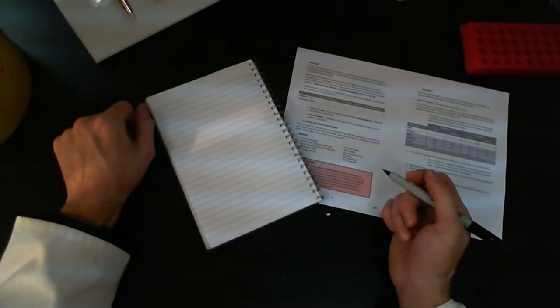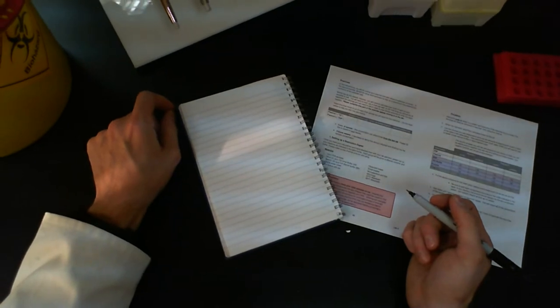Hi everyone. In this video, we're going to be looking at setting up restriction digests and also at loading a gel. Okay, so let's get the big scary math out of the way first.